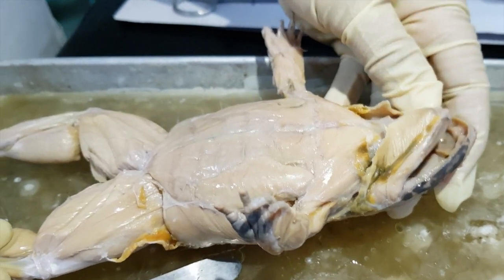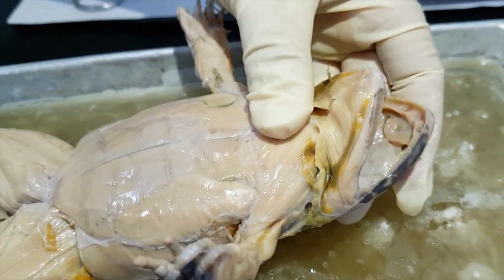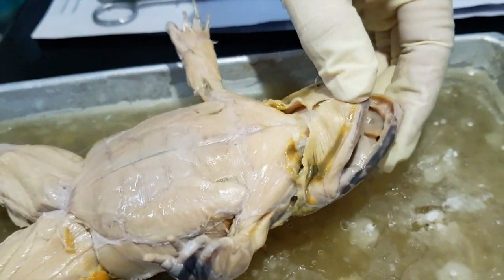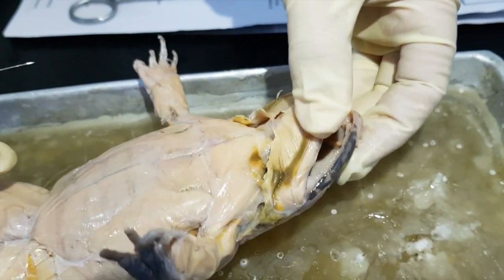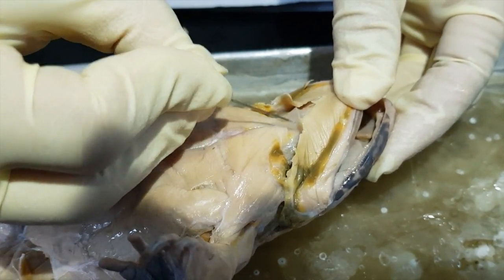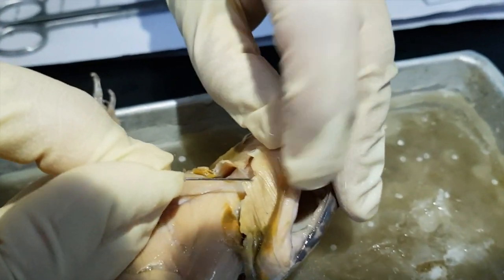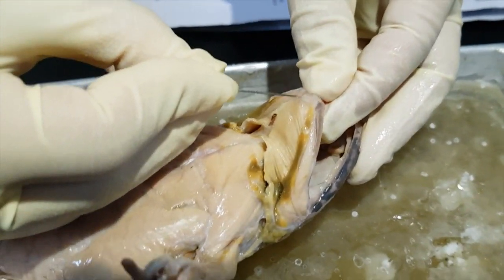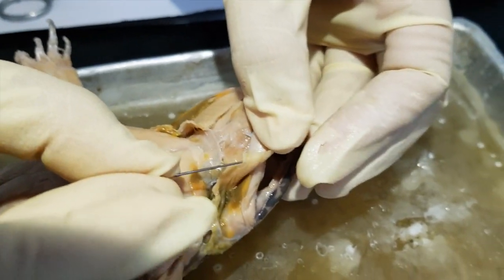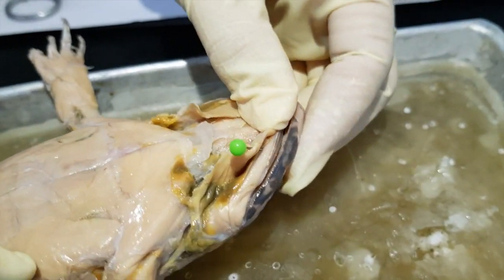Okay, so we'll start identifying muscles on the ventral side. Okay, I already cut some of the muscles, and we're going to go through, starting with the muscle that is just below the jaw. This muscle here with the striations that runs from the edge of the jaw is the mylohyoid. Okay, so this cut muscle. You're just going to cut it from this portion here down to reveal the underlying muscles. I'll pin this one here on the side to reveal the underlying muscles.